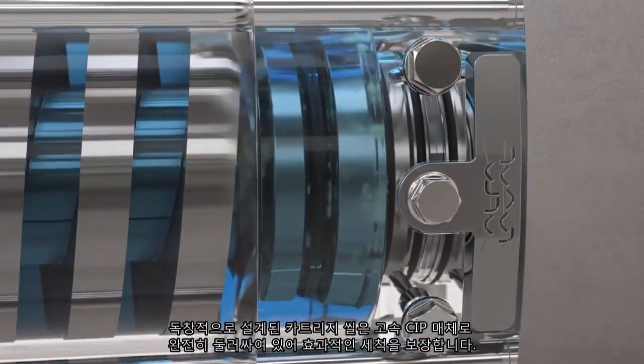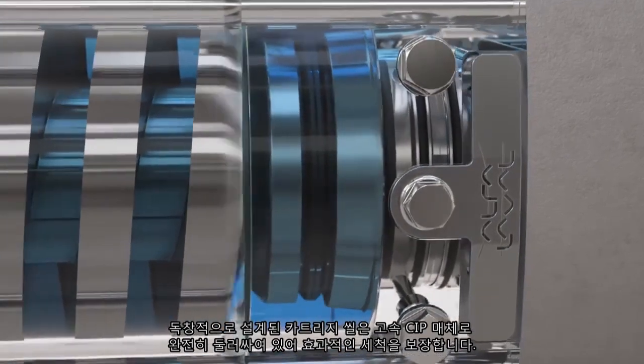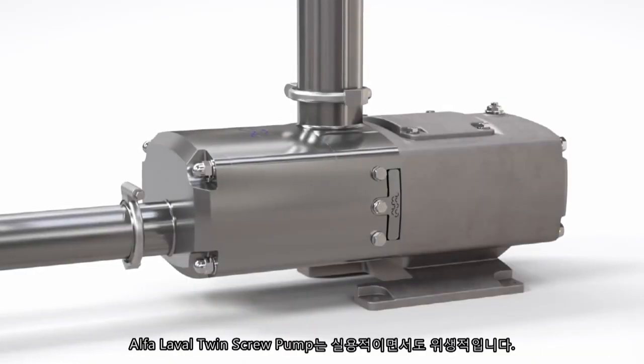A uniquely designed cartridge seal, fully surrounded by high-velocity CIP media, ensures effective cleaning. Profiled elastomers in the pump ensure faster, easier cleaning, thereby eliminating any risk of cross contamination. The Alfa Laval twin screw pump is both practical and hygienic.